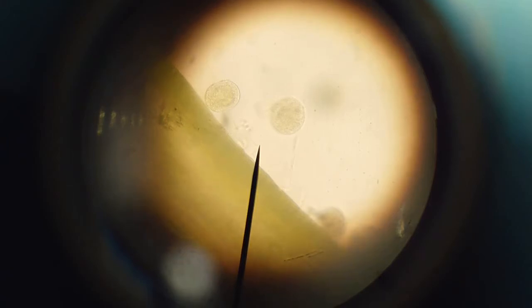This is a colony of Vorticella. They're not doing much right now, which is kind of annoying.